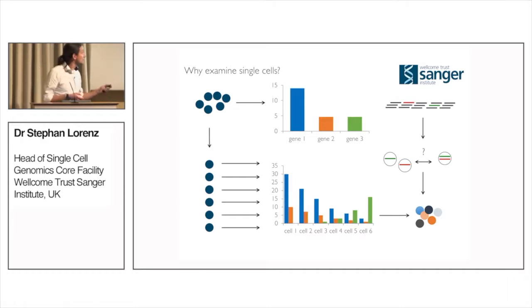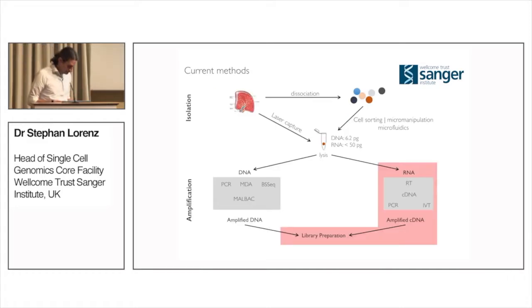There are also benefits when it comes to single-cell genome sequencing. Let's say these are your read piles. You see 2 somatic variants, a red one and a green one, and okay, what does it mean? Are these variants present in the same cell? Are they present in different cells? Are these maybe tumor subclones? With single-cell sequencing, you can start to actually address these questions which bulk methods just wouldn't have given before, so that our understanding develops from blue dots to colorful dots with different properties in our tissues of interest.